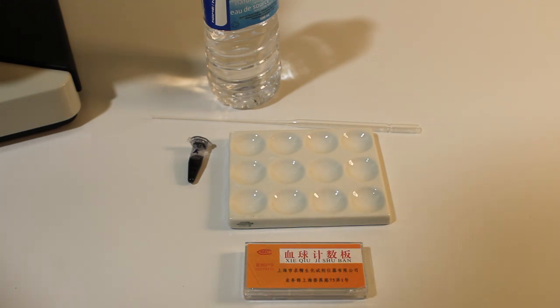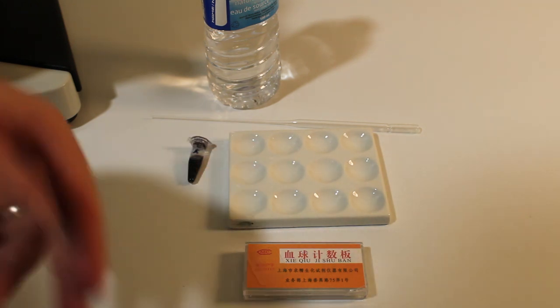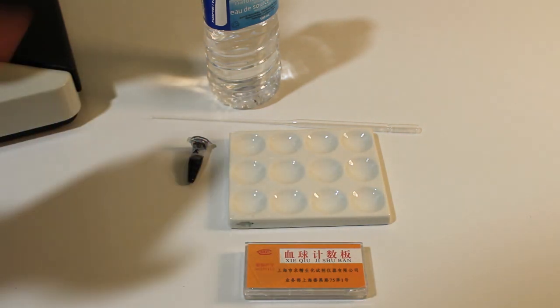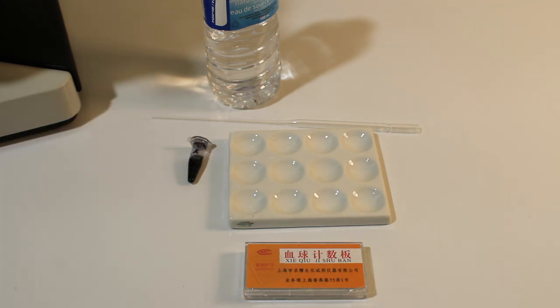You will likely also need to do serial dilutions to perform accurate counts, so for that you're going to need some sort of spot plate or other dish to dilute samples in, as well as a pipetter and some water. And if you want to do viability staining you are also going to need your 0.4% Tri-Pan Blue as discussed in Microbrews Episode 7.